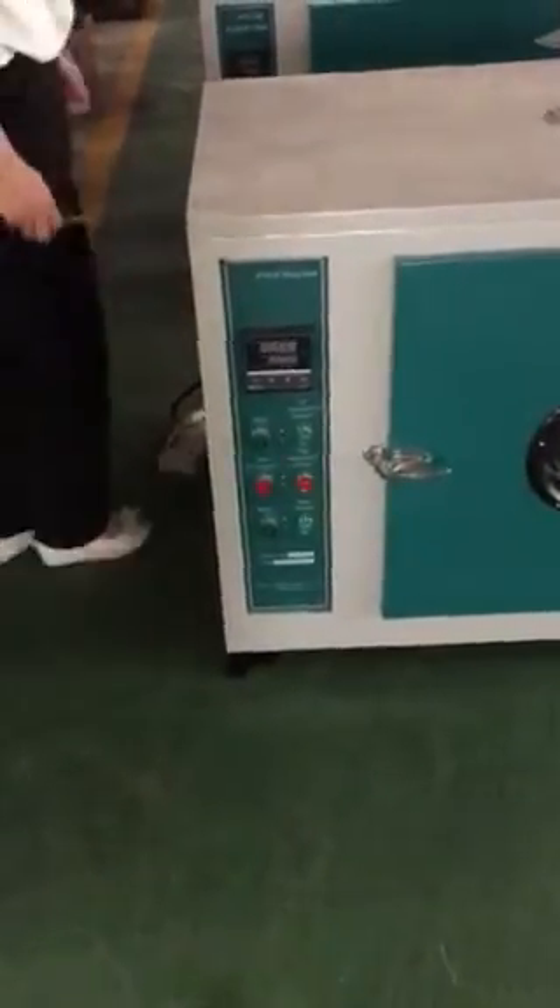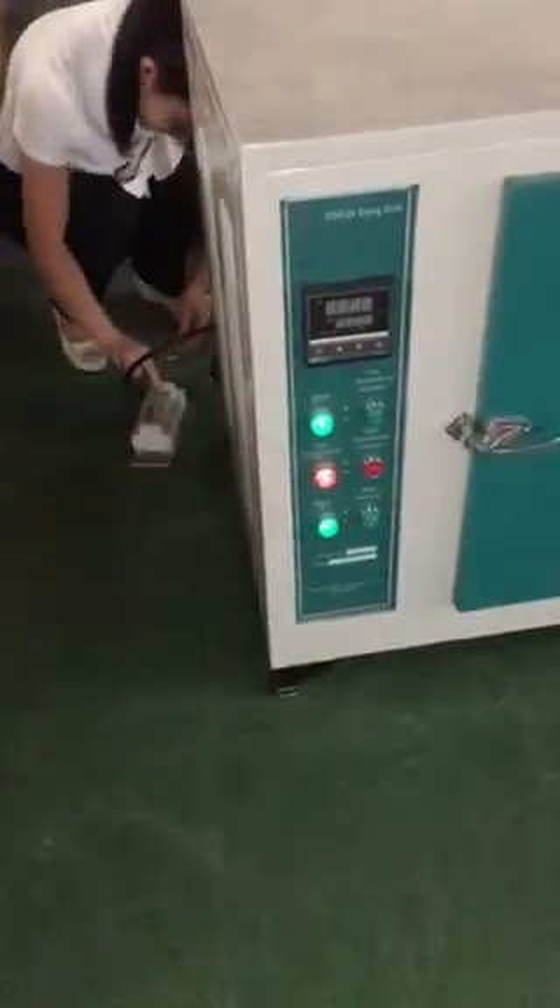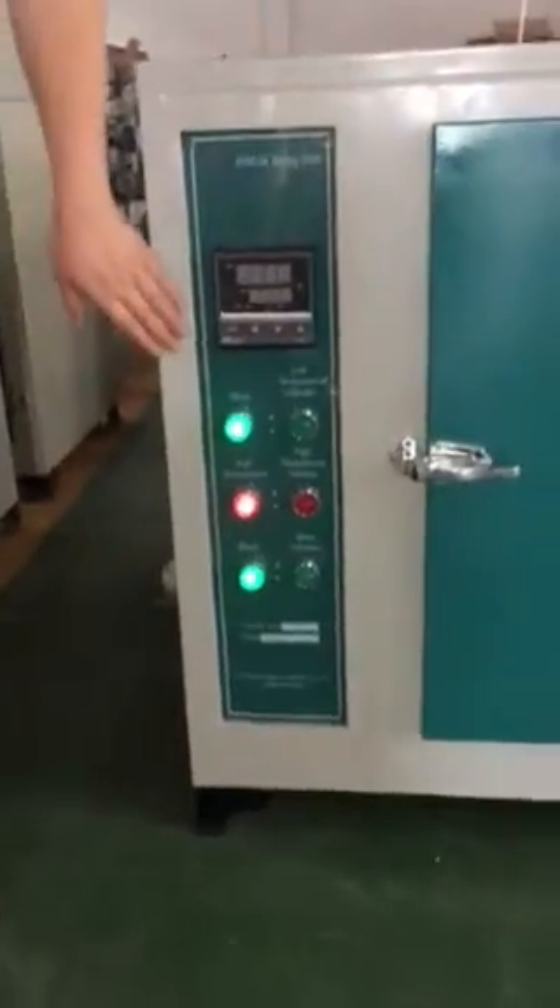Now it's powered off. Connecting this. Now it's powered on.